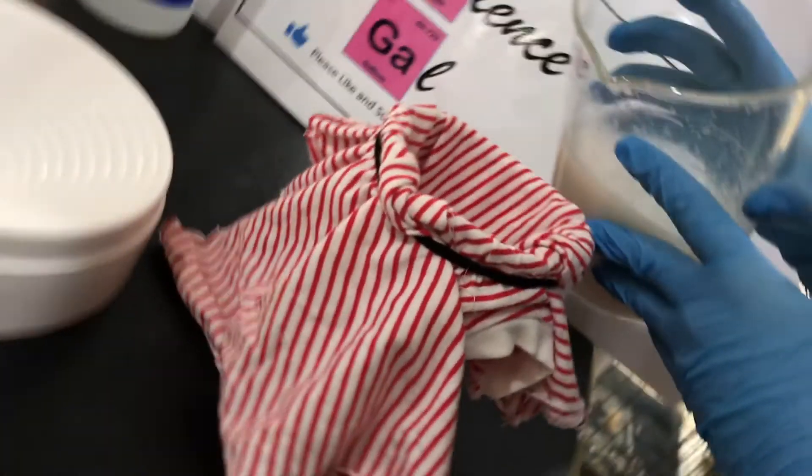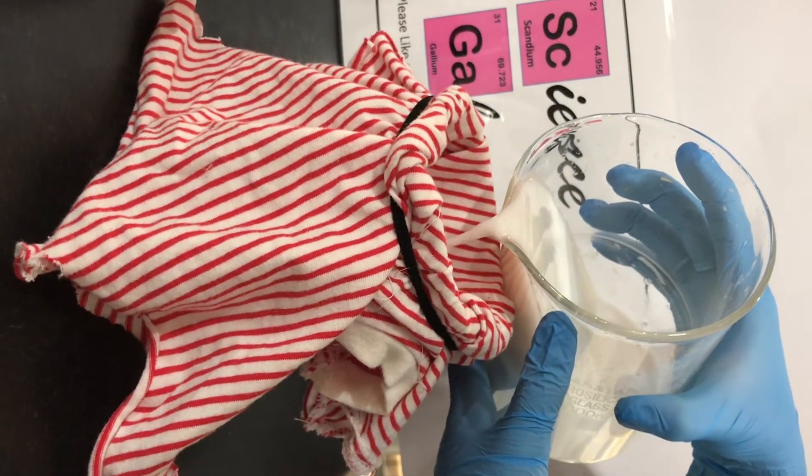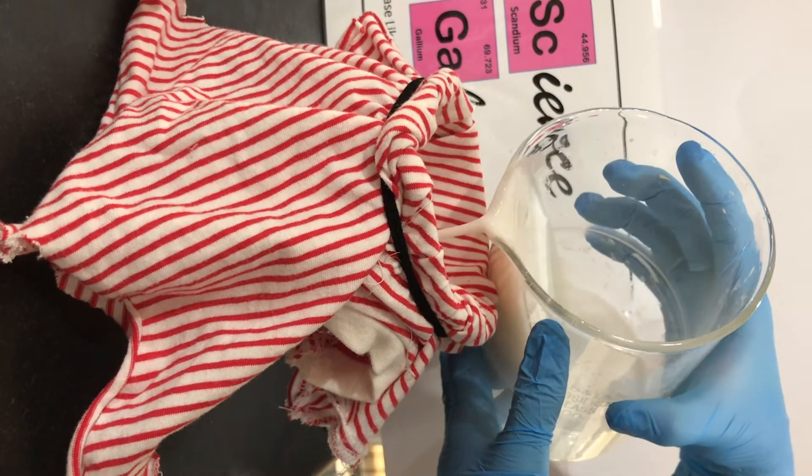Now to separate the remainder of the calcium hydroxide, I used a cloth filter. Don't forget to prime it before by running some water through it. Pour all of it into the filter.